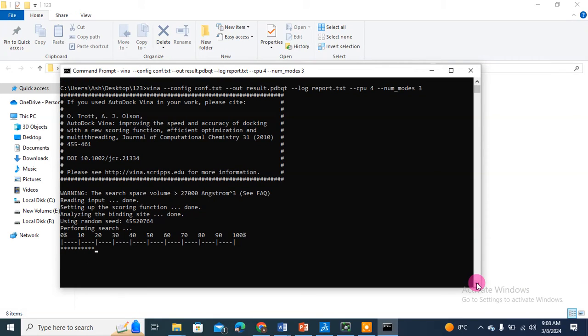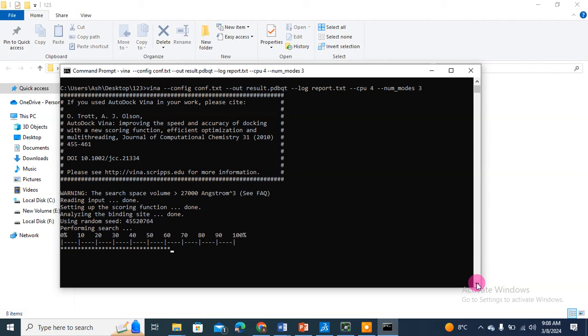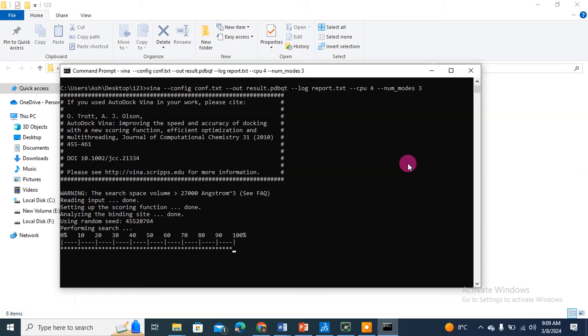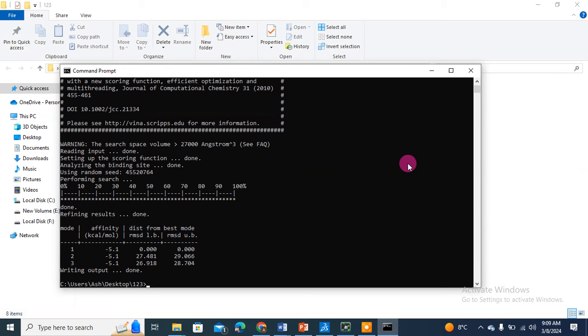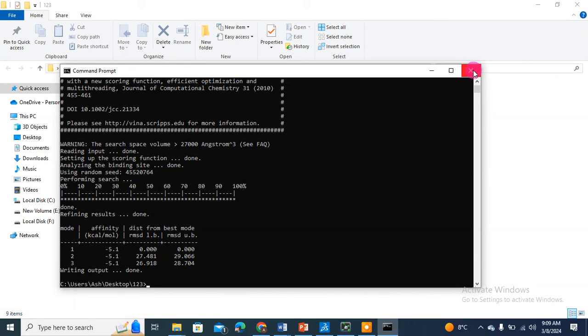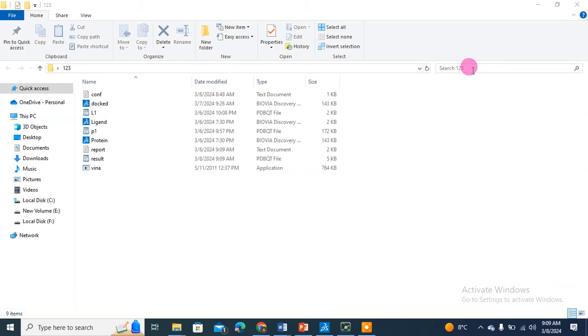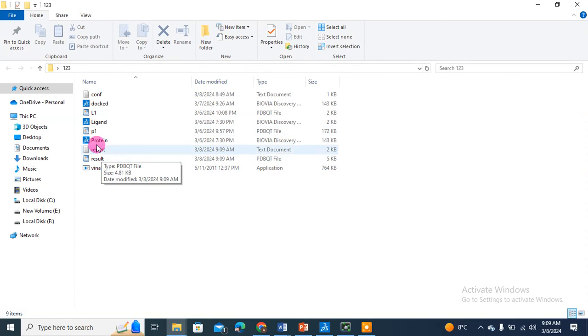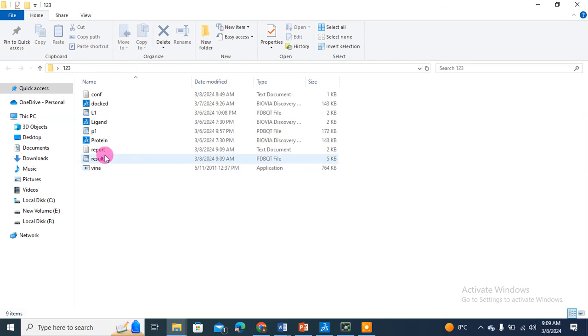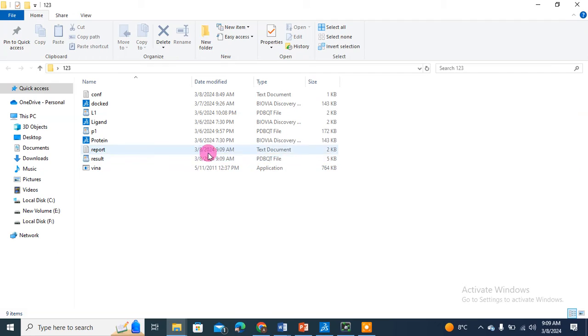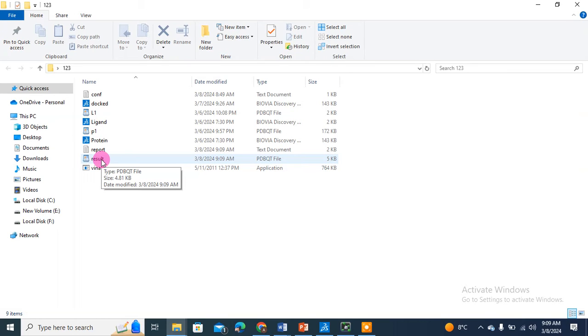Now it says analyzing the binding site. Last time it generated nine energies for nine different poses. This time it will generate three energies because I've asked it to generate energy for three poses. You can see one, two, three. I will quickly close this. Now see, this is our result.pdbqt.